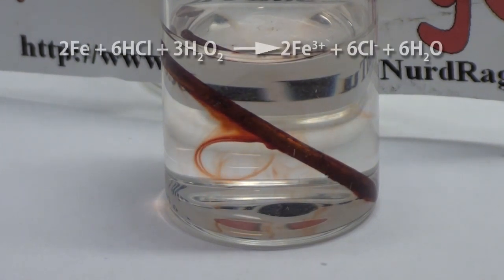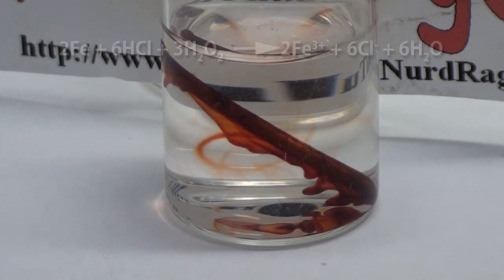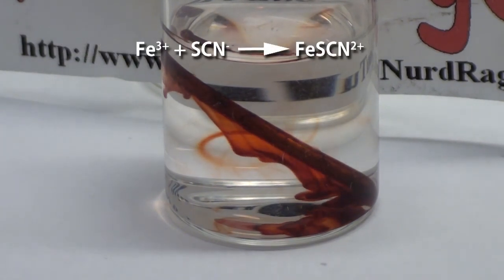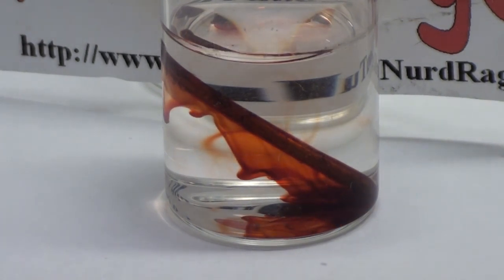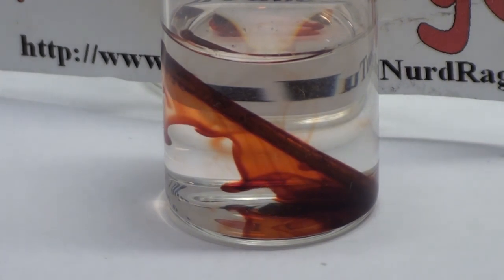What's happening is first the hydrochloric acid and hydrogen peroxide are reacting with the iron to produce iron 3 ions. These ions then react with the thiocyanate ions to produce iron thiocyanate ions. These ions are red in color and give the appearance of blood.